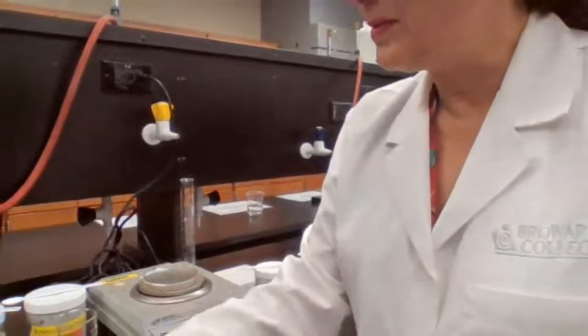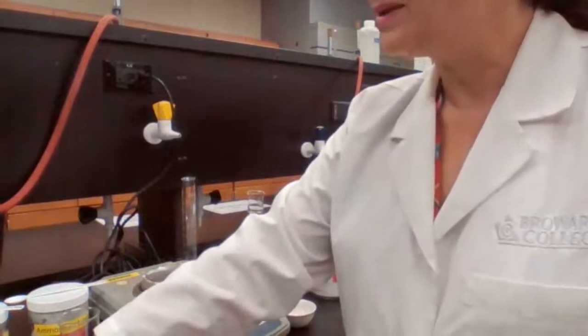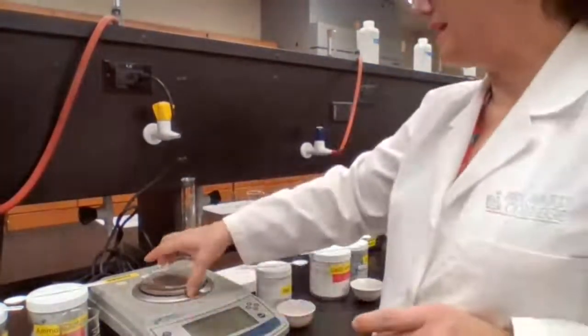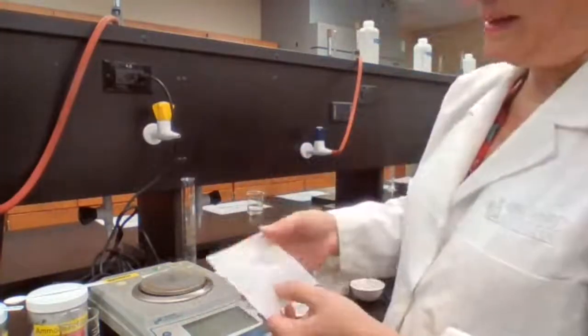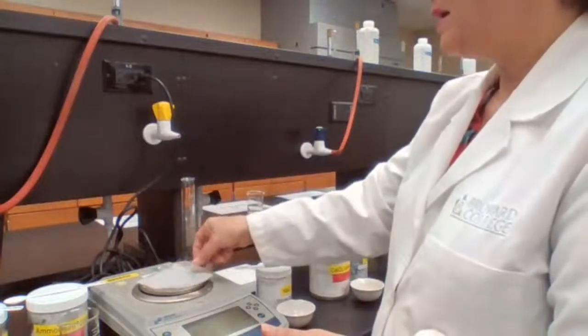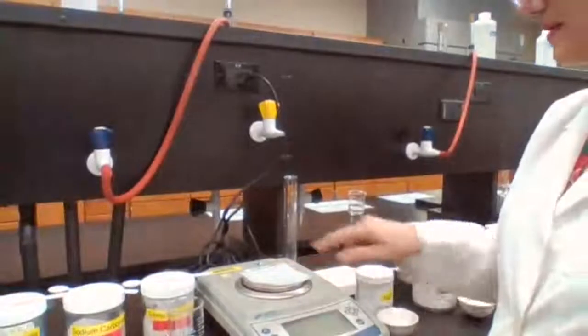Next, we are moving to measuring mass, part 2, measuring out substances. This is like indirect measurement. This is the time when we have chemicals, we are measuring chemicals. We cannot place the chemicals on the balance pan. So what we do first, we are going to place the weighing paper.